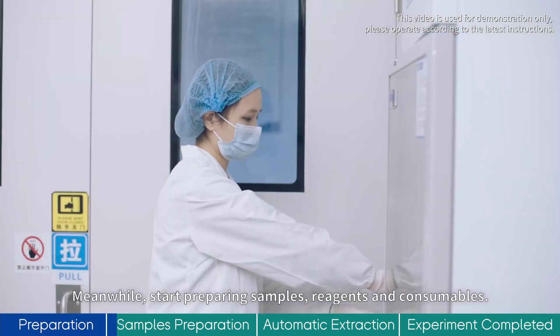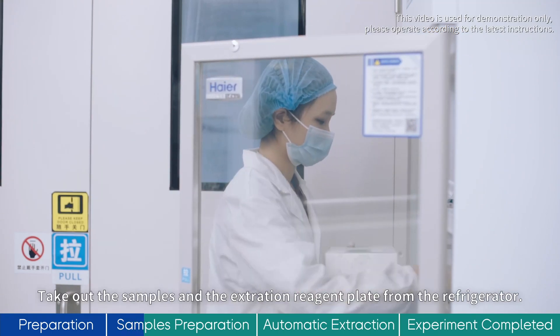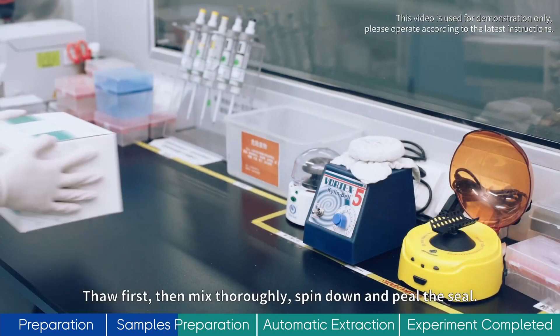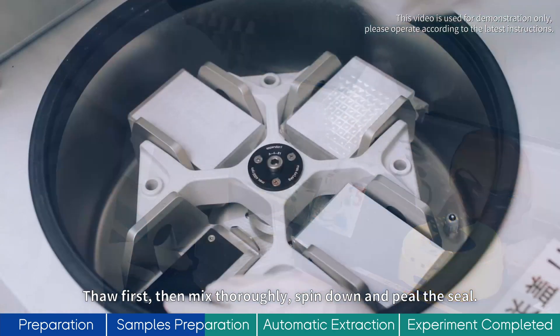Meanwhile, start preparing samples, reagents and consumables. Take out the samples and the extraction reagent plate from the refrigerator. Thaw first, then mix thoroughly, spin down and peel the seal.